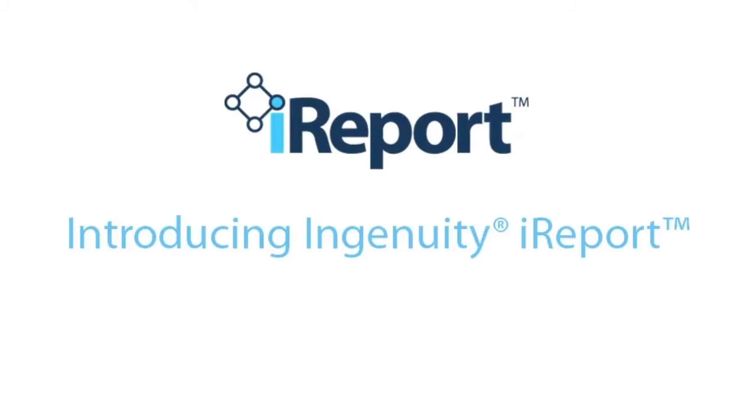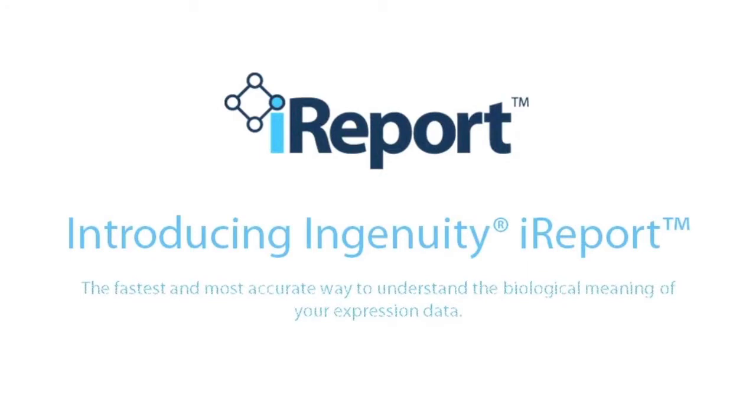Introducing Ingenuity iReport, the fastest and most accurate way to understand the biological meaning of your microarray, RNA-seq, or qPCR expression data.